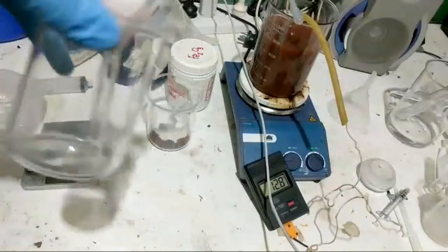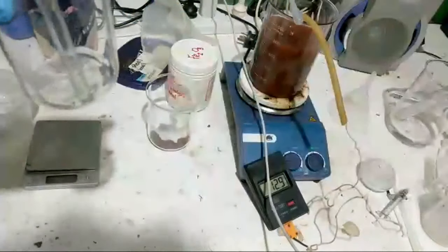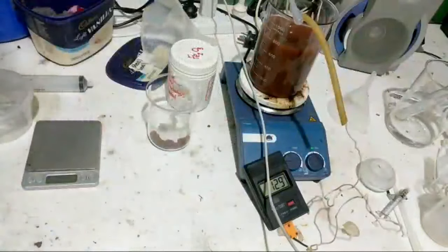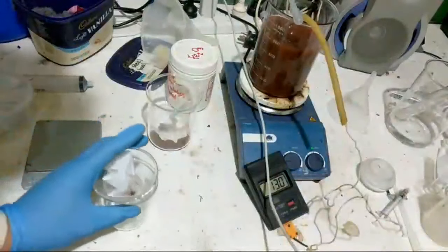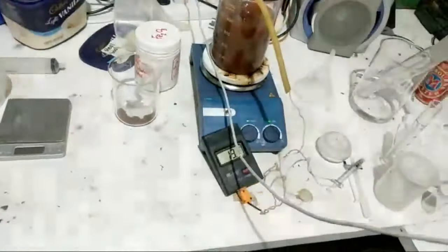Absolutely no colour as of yet. Nothing. So, it doesn't look like there's any ferrate produced as of yet. That's okay. We'll see how a bit of heating goes about it.